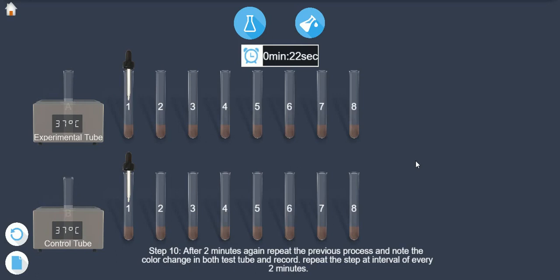Step 10: After 2 minutes, again repeat the previous process and note the color change in both test tubes and record. Repeat the step at intervals of every 2 minutes.